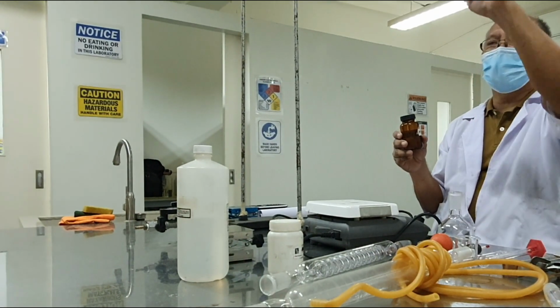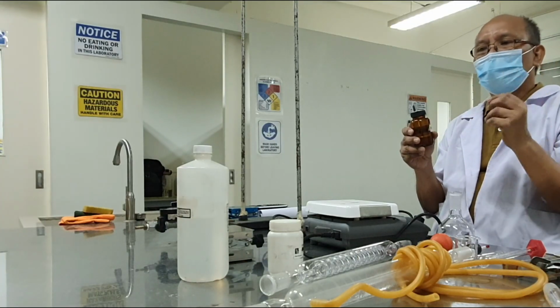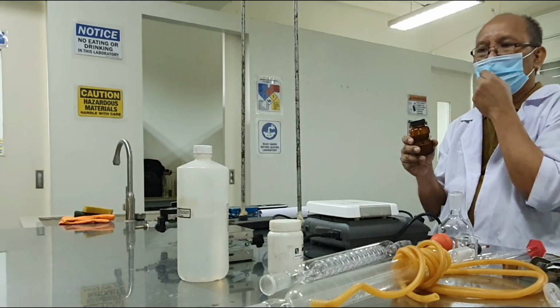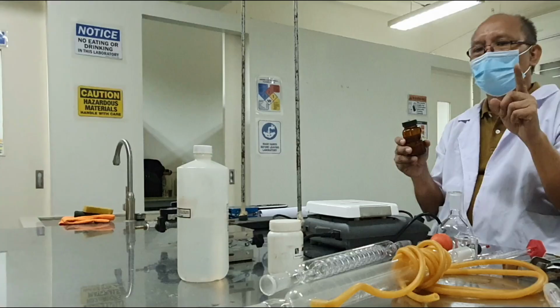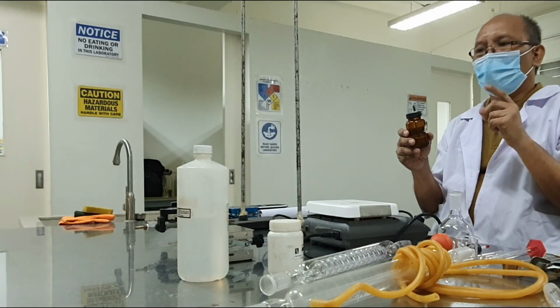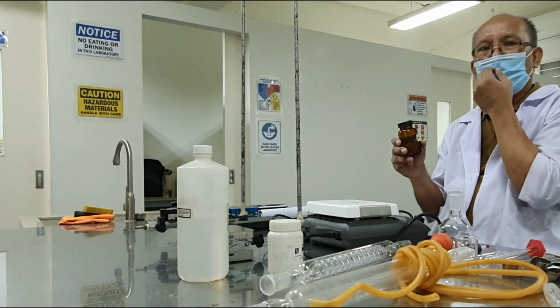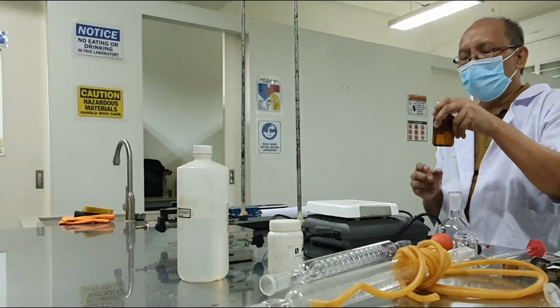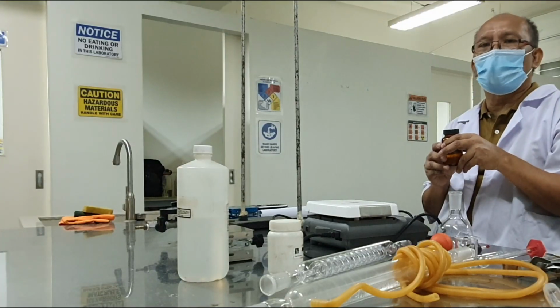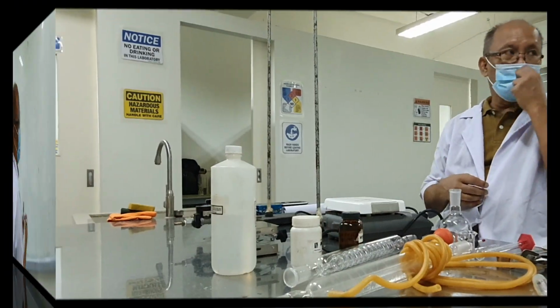To see whether there is a separation of the two, you're going to plot the change in temperature of the thermometer versus the volume of distillate that is coming out from the condenser. When you plot that, you should be able to observe a zigzag profile. What do you mean by that?